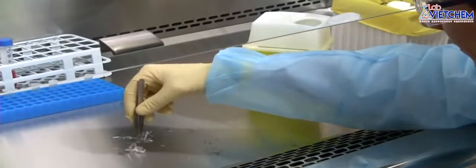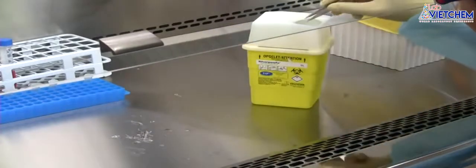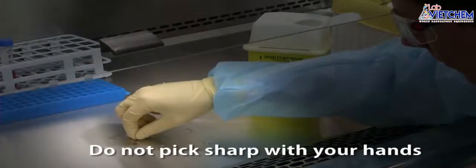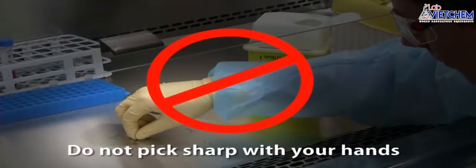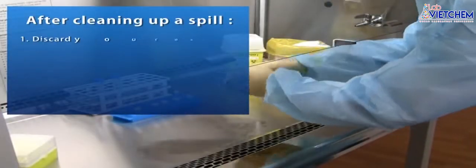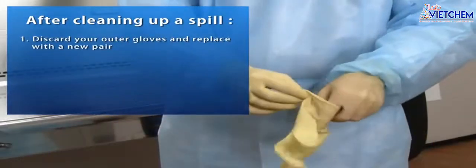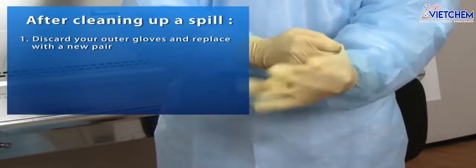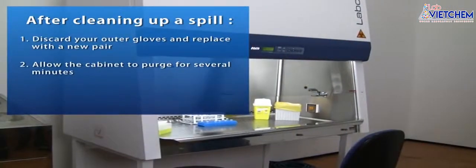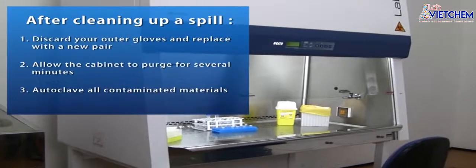If there are any sharps, such as broken cryoampules, pick it up with a pair of forceps or another instrument and place it in the sharps container. Never pick up sharps with your hands. After cleaning up a spill, discard your outer gloves and replace them with a new pair. Allow the cabinet blower to run, purging the work zone for several minutes. And be sure to autoclave all contaminated materials.